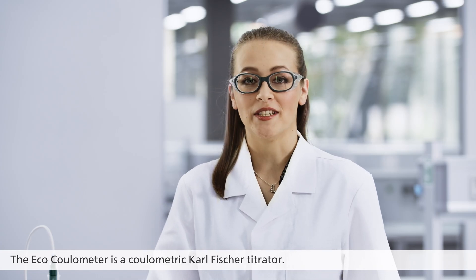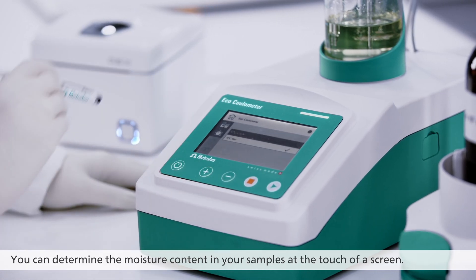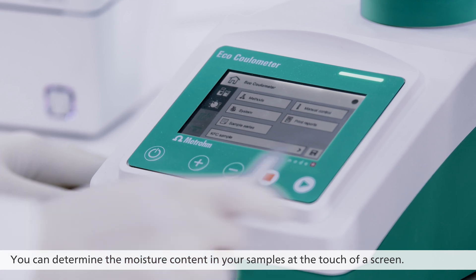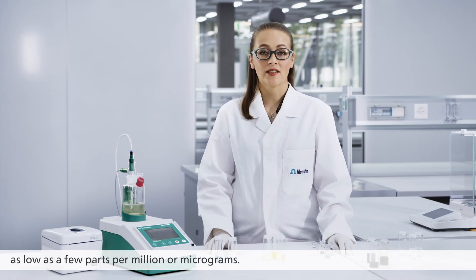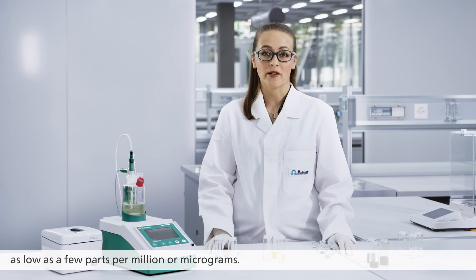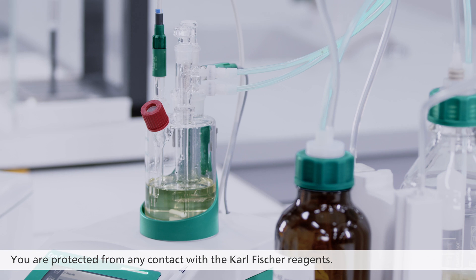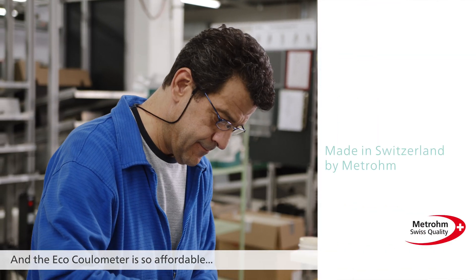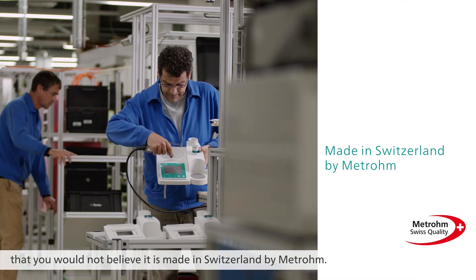The ECHO Coulometer is a coulometric Karl Fischer titrator. You can determine the moisture content in your samples at the touch of a screen. You get accurate and precise results for concentrations as low as a few parts per million or micrograms. You are protected from any contact with Karl Fischer reagents. And the ECHO Coulometer is so affordable that you would not believe it is made in Switzerland by Metrohm.